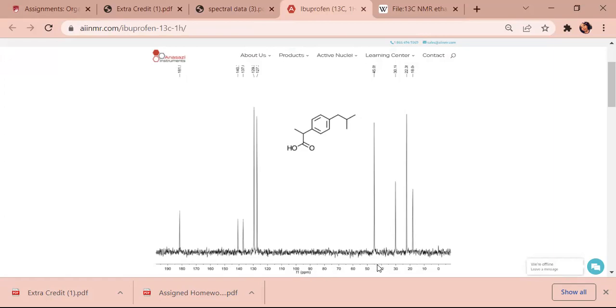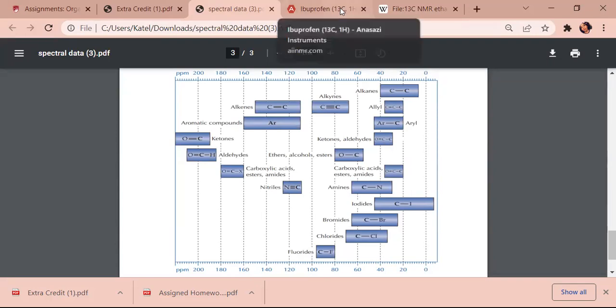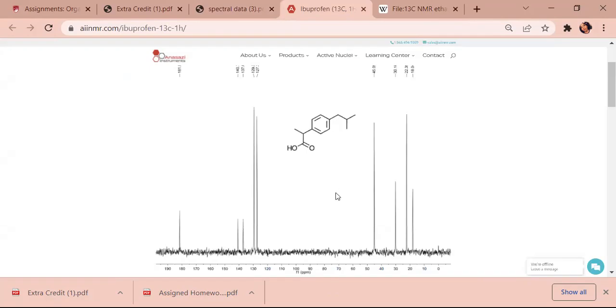So now we have these guys right here. So we have about 45 marks. So we'll go over and we'll look around 45, which will probably be around here. So we got a carbon and a chlorine, a carbon and a bromine, carbon and a nitrogen. We have a ketone. So I believe that one would also be just signaling this guy right here.